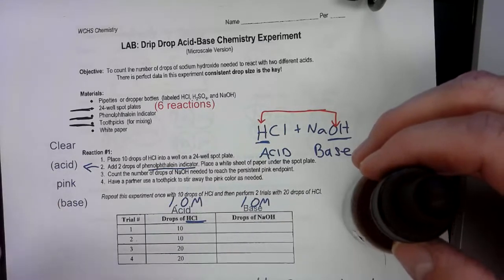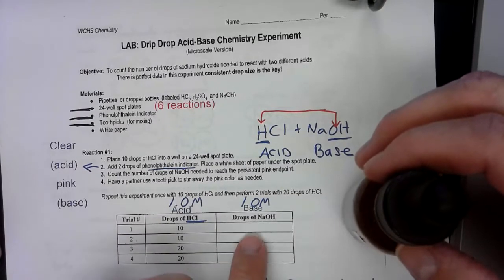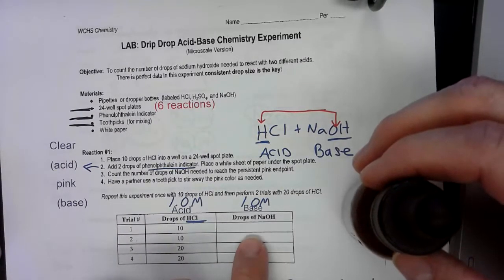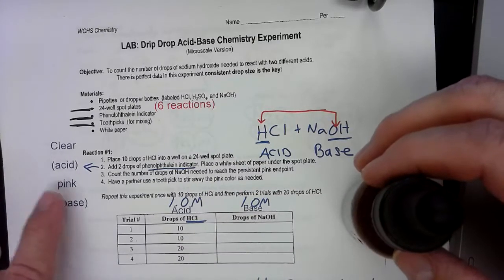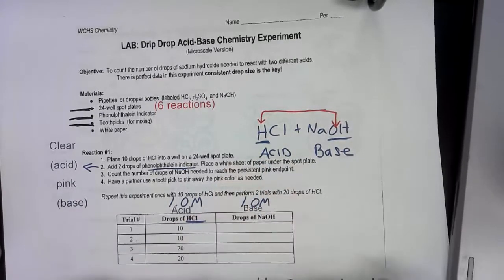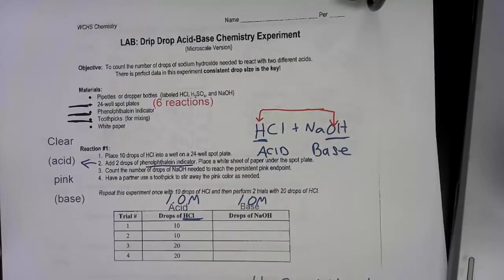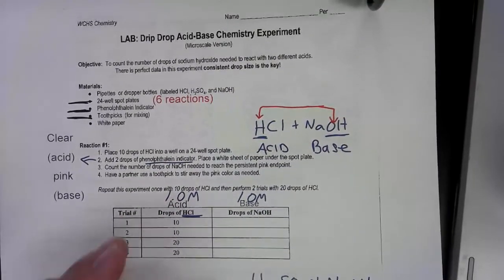And when you add in so many drops of acid, then it's going to be clear, and then we gradually add in a drop at a time of NaOH until they're equal. And when they go 1 drop over, then it's going to make it turn pink. So when it turns pink, it means it's totally reacted. Okay, so we're talking about the amounts, not just doing a reaction, but we're looking at the amounts. So we're going to do this reaction first.